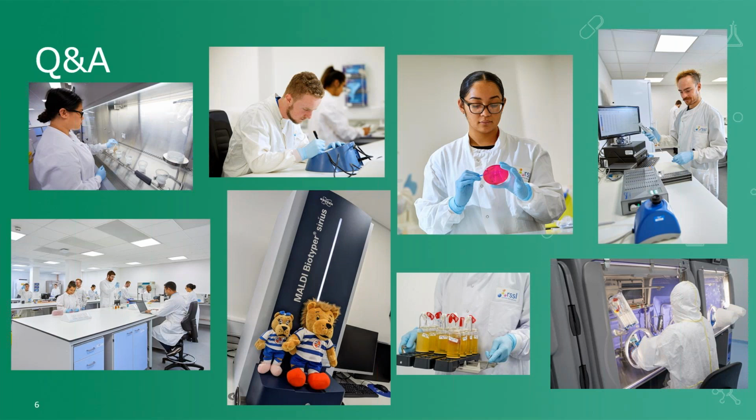So fungal spores can be smooth, what's called reticular, or spiny. And this all relates to what happens when they land on a surface and what kind of angle of the surface is covered by the spore, and how easy that spore is to remove from the surface. So with Aspergillus, it can be in any one of those three states.